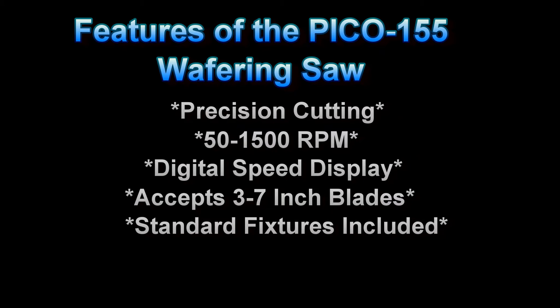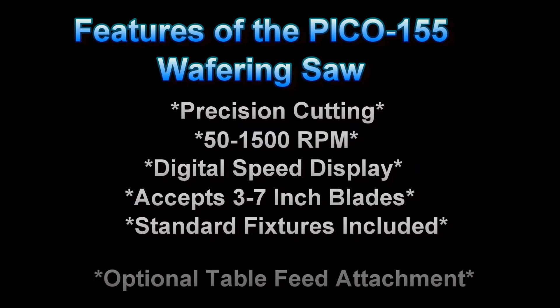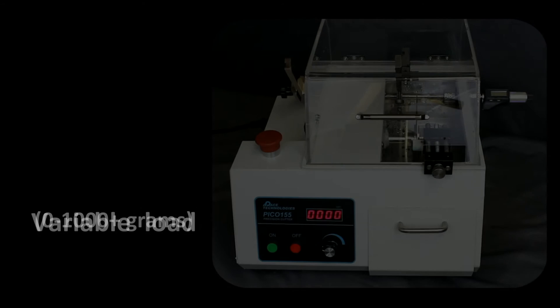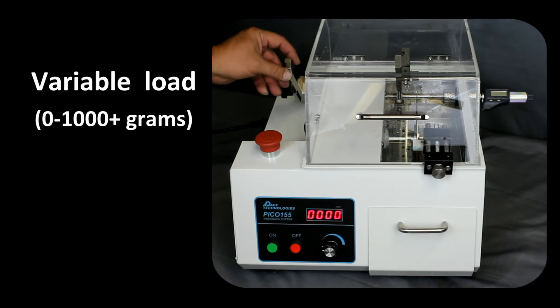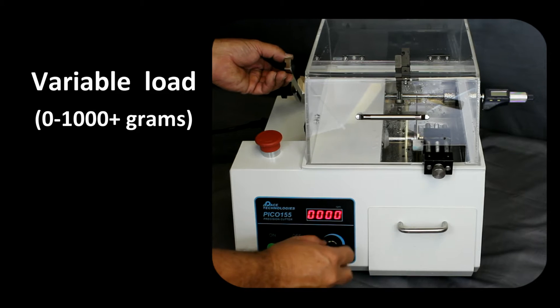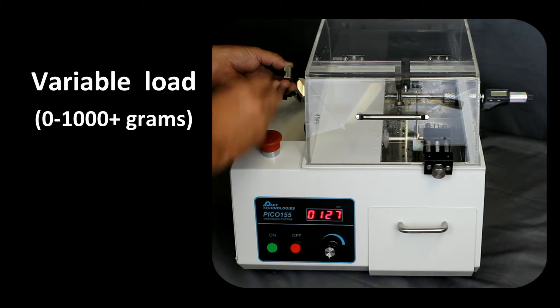Included with the saw are a wide range of fixtures. There is an optional table feed attachment for cutting printed circuit boards. The Pico 155 has an adjustable load that can be varied to provide minimal cutting force for very sensitive samples, or increased to relatively high loads for tougher samples.